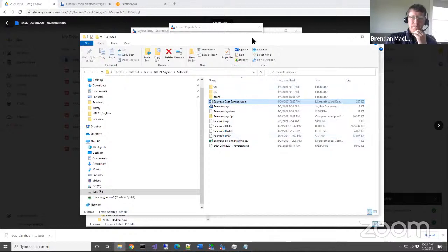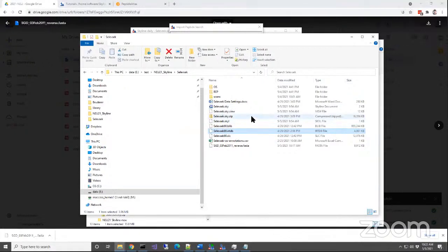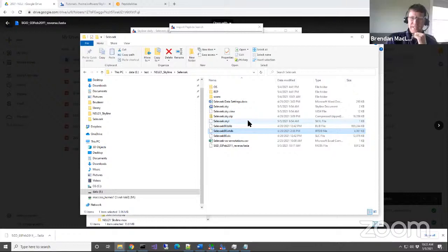Yeah, I didn't really want to get all, I got some things that were overwritten, I think. Wow, it overwrote my log because I haven't saved in a while, I guess. Okay, I'm going to hope I didn't totally mess myself up there. Don't do that. Only do that if you really want to just be done and have the right thing.